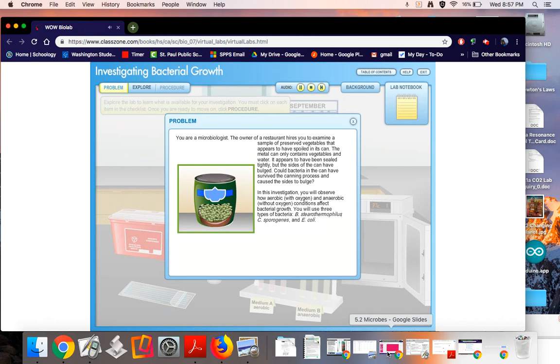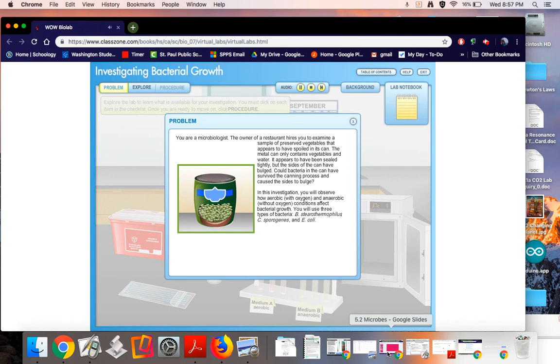In this investigation you will observe how aerobic, with oxygen, and anaerobic, without oxygen, conditions affect bacterial growth. You will use three types of bacteria: B. stearothermophilus, C. sporogenes, and E. coli.